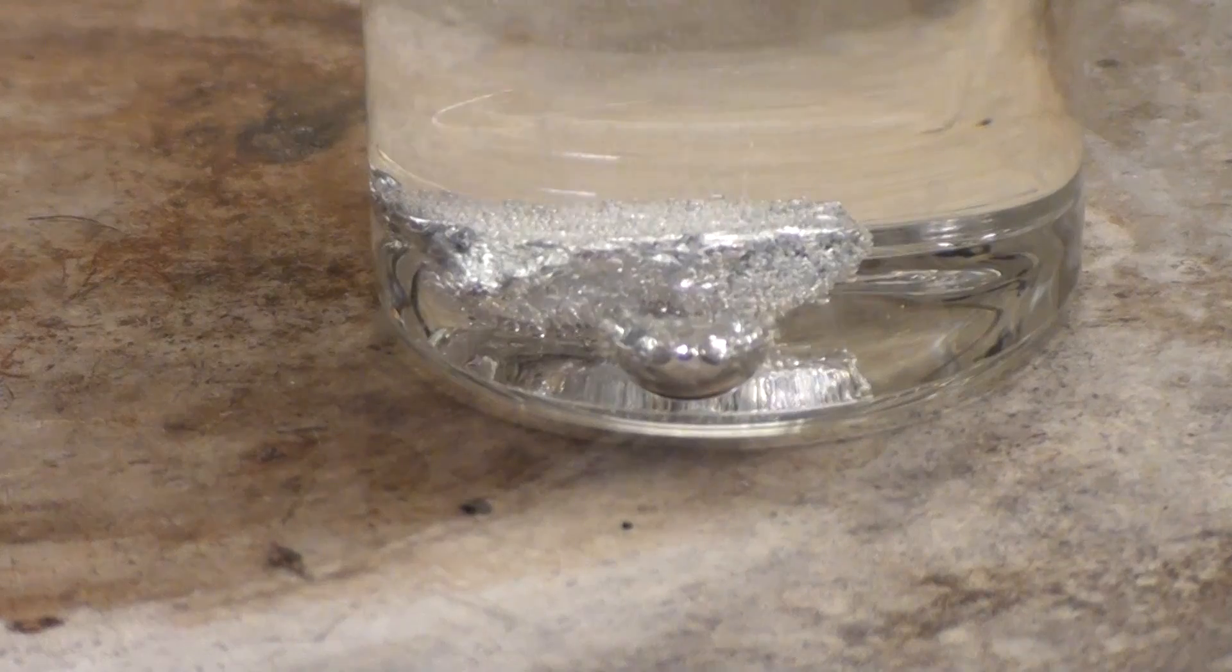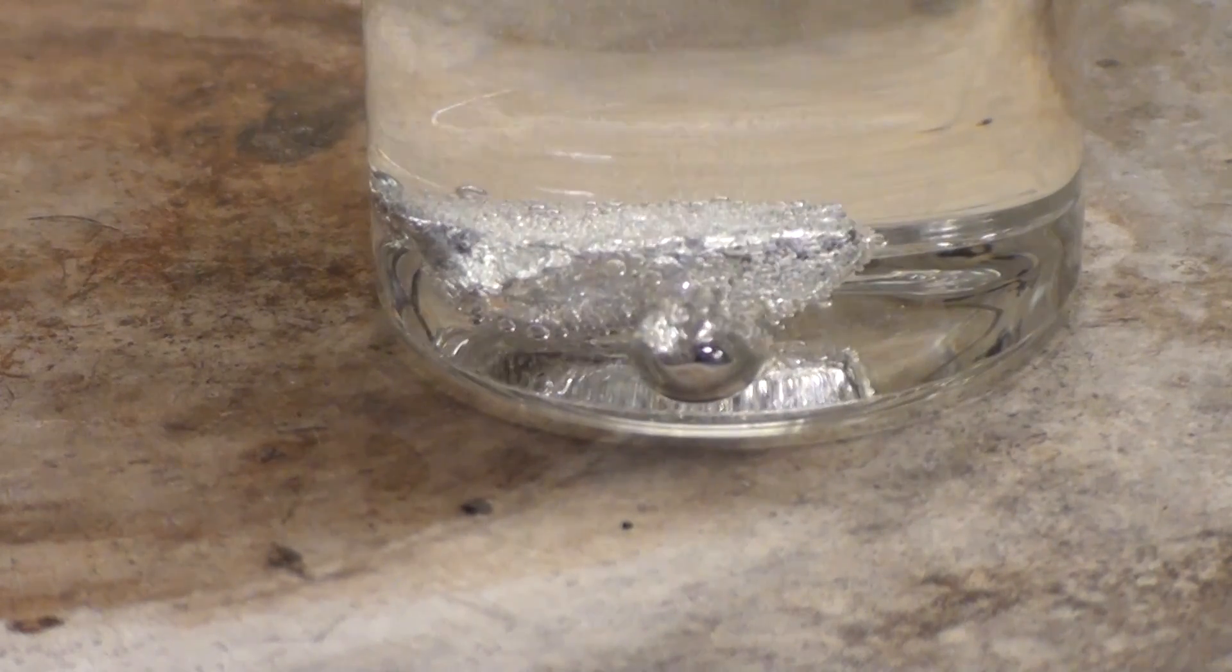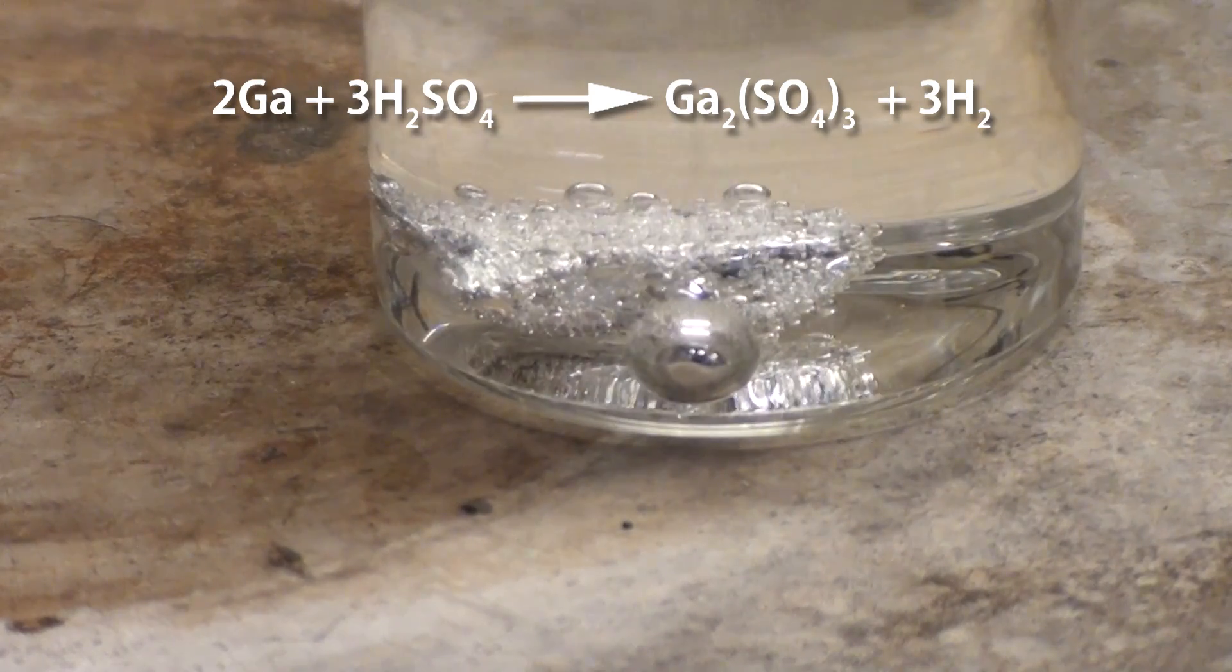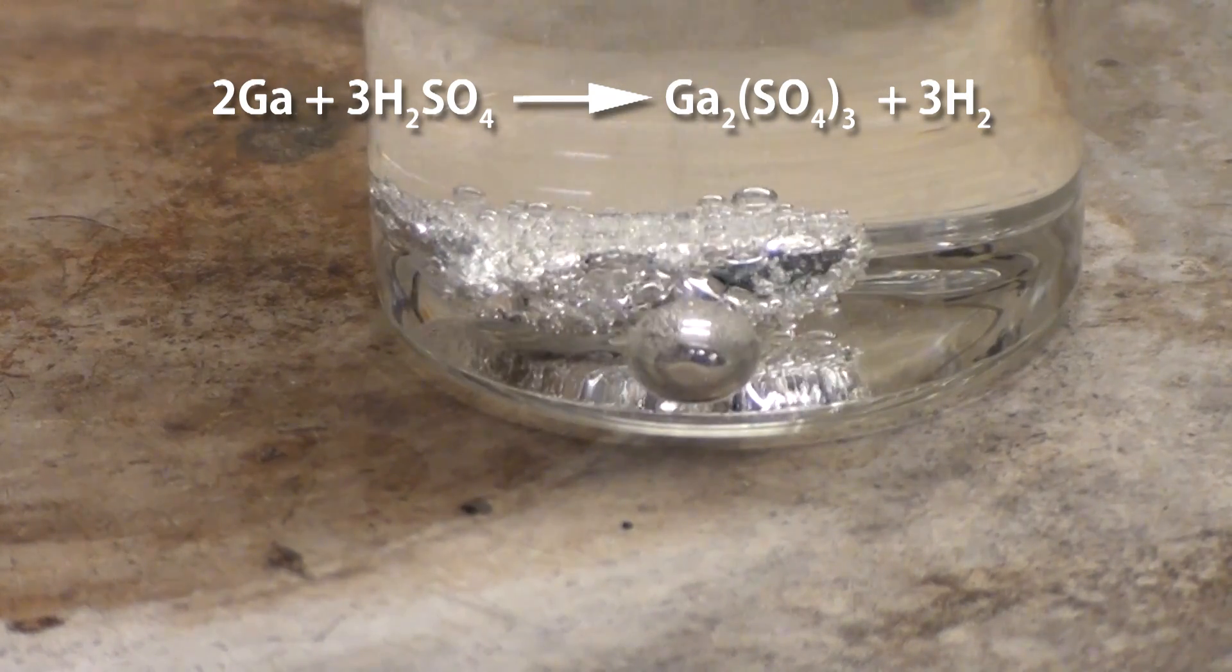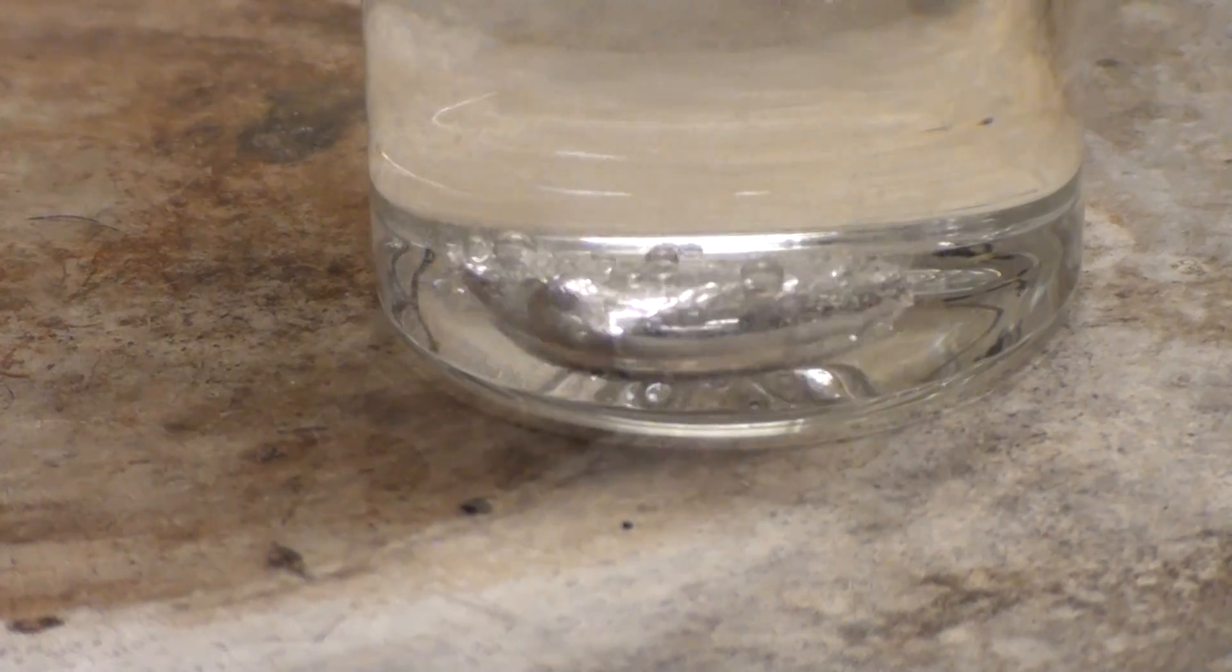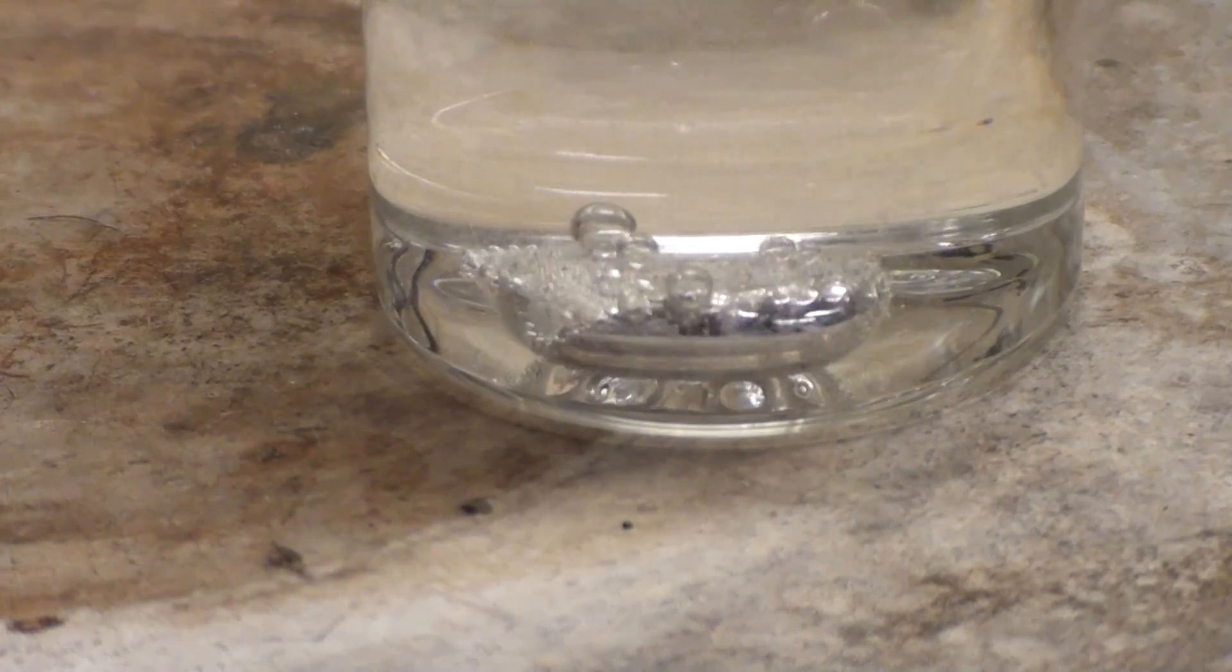Now as it heats the gallium will melt and liquefy. The sulfuric acid reacts with the gallium to form a very thin layer of gallium sulfate. This sticks to the surface and increases the surface tension of the gallium, causing it to pull itself together into a sphere. The bubbles you're seeing are actually bubbles of hydrogen as the gallium reacts.